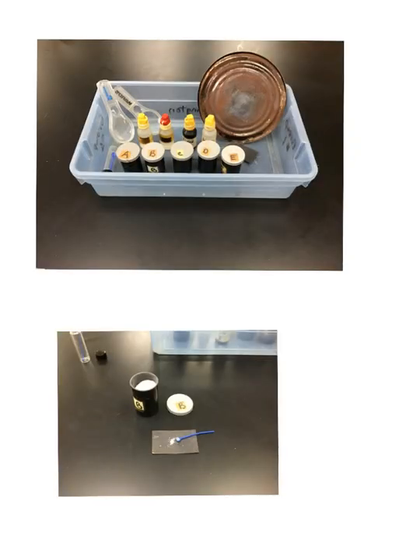Now at least you have some picture to look at, not just a page with lots of writing. You are going to come to class, and you are going to see a tote, which has all the different chemicals and compounds to work with. You are going to see the 5 powders labeled A through E in film canisters. You are going to have the 4 liquids, which you're going to use to test each of the powders, to look for chemical properties.